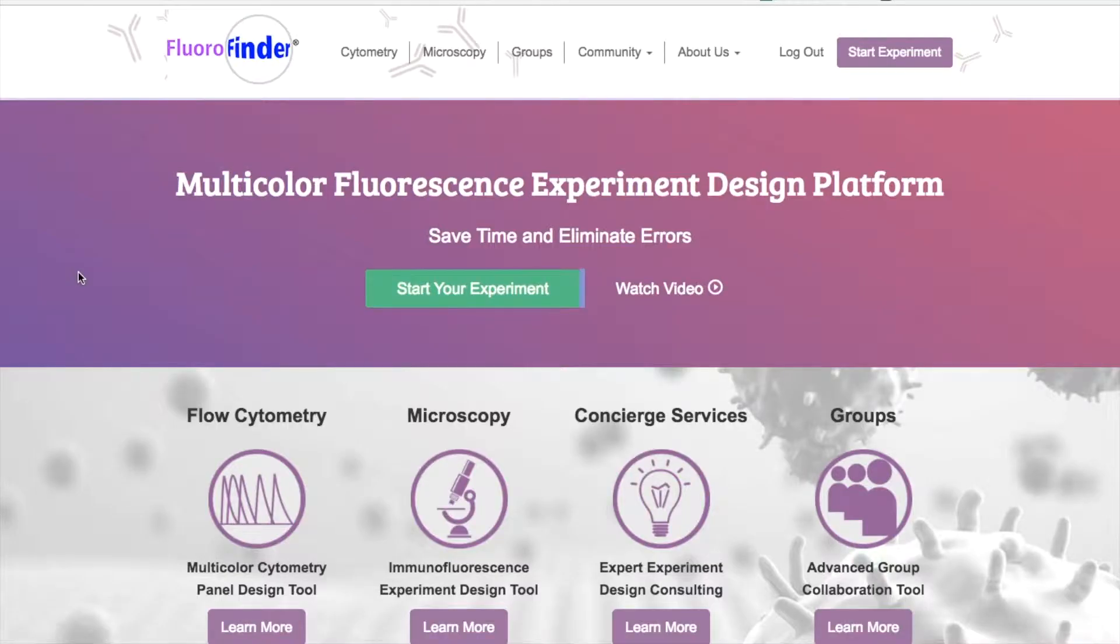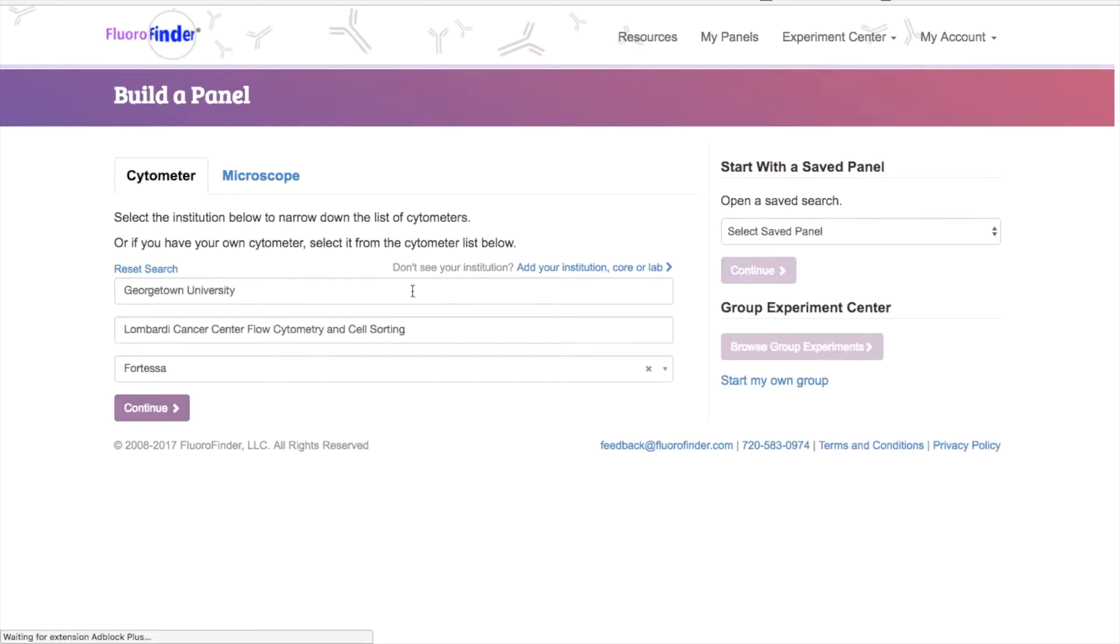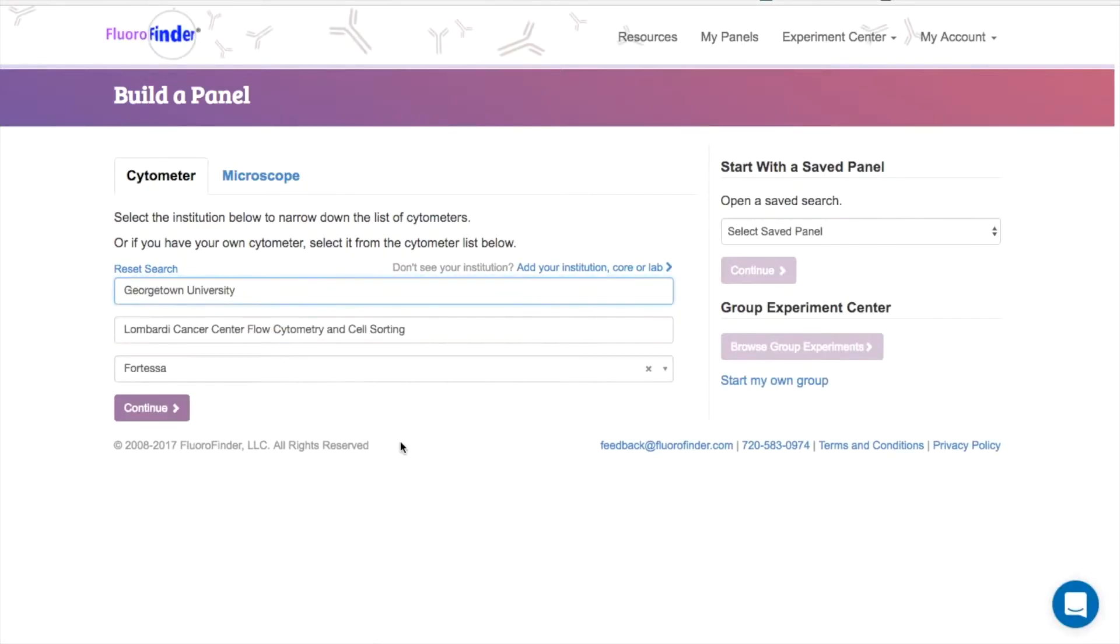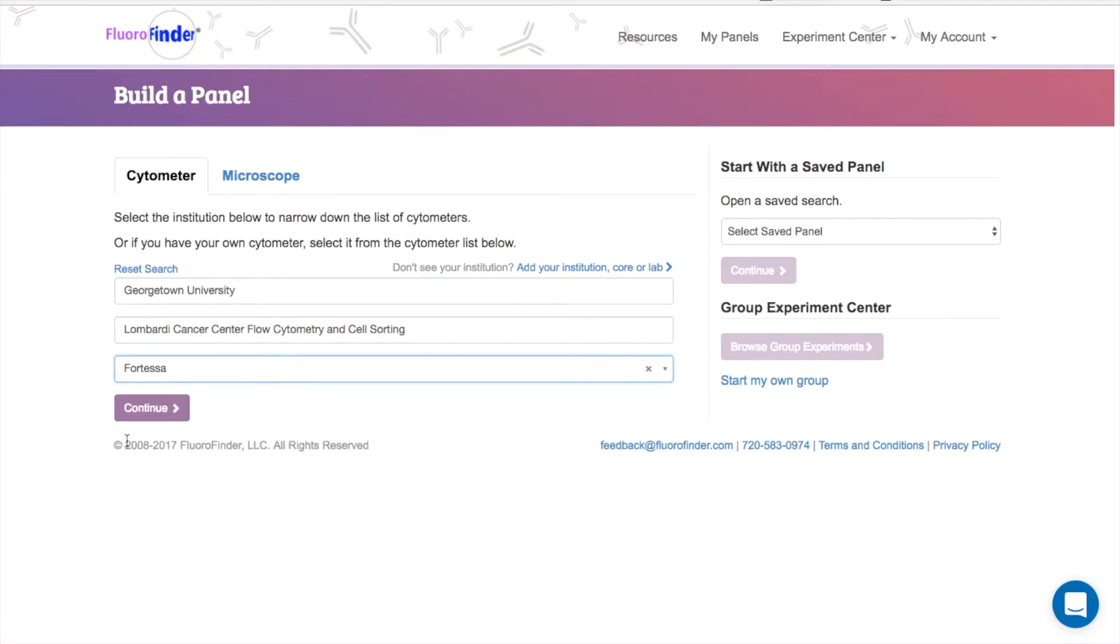Once you're logged into Fluorofinder, you can start designing your experiment by clicking this button. Here, you can choose your institution, facility, and the machine for which you want to run your experiment on. If you're unsure which machine would be best suited for your experiment, contact your core manager.